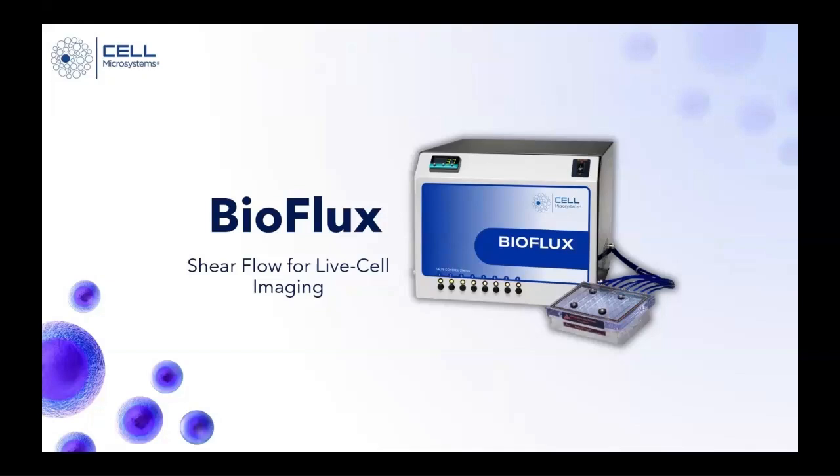Hi, thank you for the question. Whether this would work with algae cells will depend on the size of the cells and whether they can fit through the microfluidic channel. So it would be a matter of understanding what those sizes are. And in terms of choosing the plate, it really depends on the application. We have some plates that are intended for low shear assays that can run up to 20 dynes per centimeter square. And then we have other plates that are intended for high shear assays that can go up to 200 dynes per centimeter square. So it'll really depend on the experimental design.